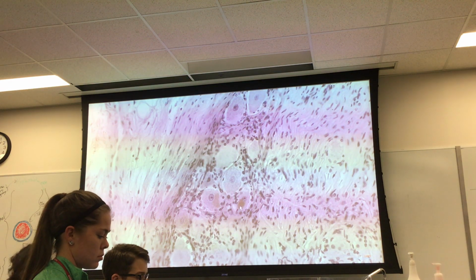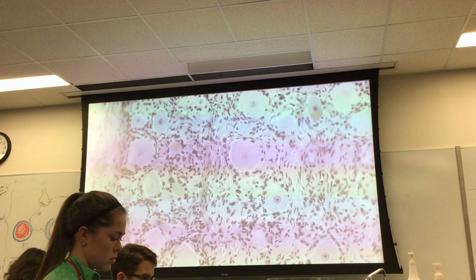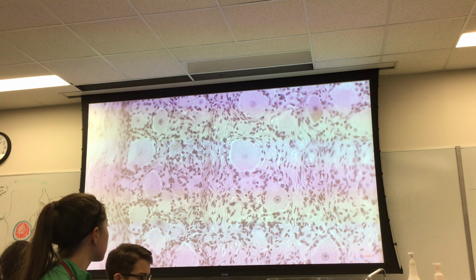Number two, this kind of gives it away. What's that stuff right there? That's Nissl substance. No, something's wrong. Think before I speak. Lipofuscin granules. That tends to be associated with these cells. Number three, although these aren't the really super best examples, if we went to another area, again, the whole thing's just finding good representative images. Like this one, I guess. More or less an intact layer of cells, and by the way, what are those cells called?